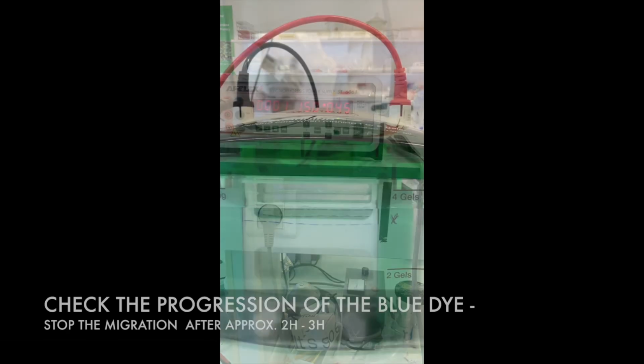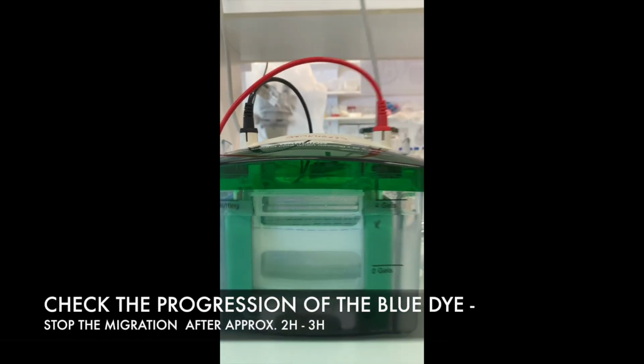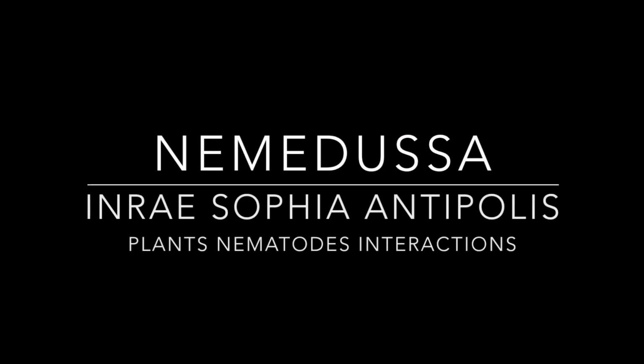Stop the migration when the migration front in blue has covered the desired distance, the bottom of the gel for example, in this case.